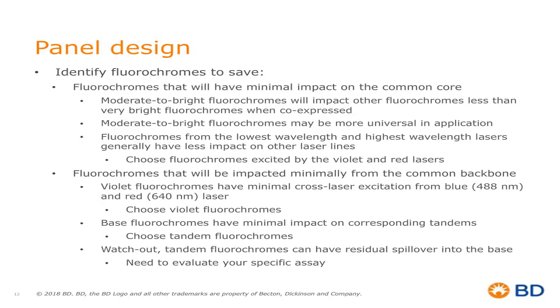Also, base fluorochromes have minimal impact on corresponding tandems. What that means is if my common backbone is built of a lot of bases, they won't hurt my tandems if I use tandems as my drop-in markers. Now there is, however, a watch-out that my tandem fluorochromes can have residual spillover into the base.